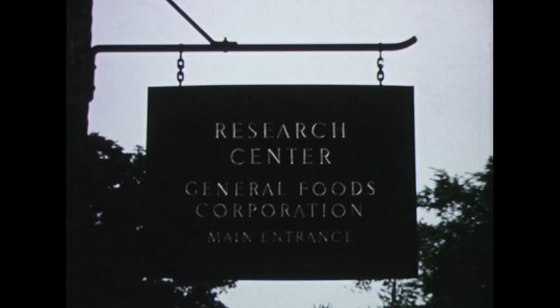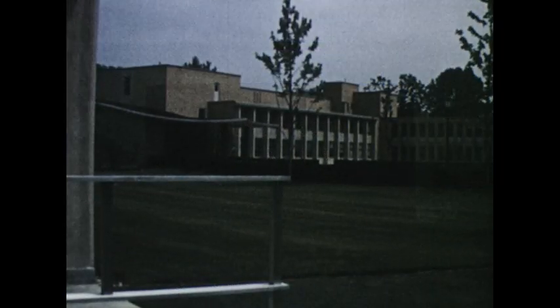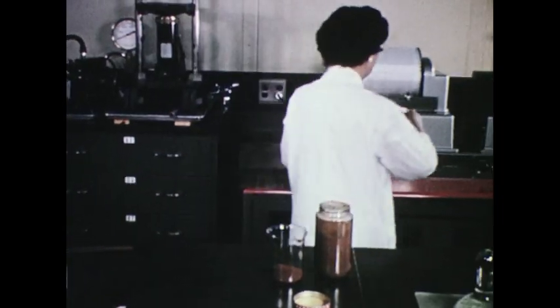Infrared spectroscopy plays an important role in many industries. At the General Foods Research Laboratories, scientists are seeking the answers to such questions as what substances give coffee its fragrant aroma, by investigating the infrared spectra of various components separated from coffee.